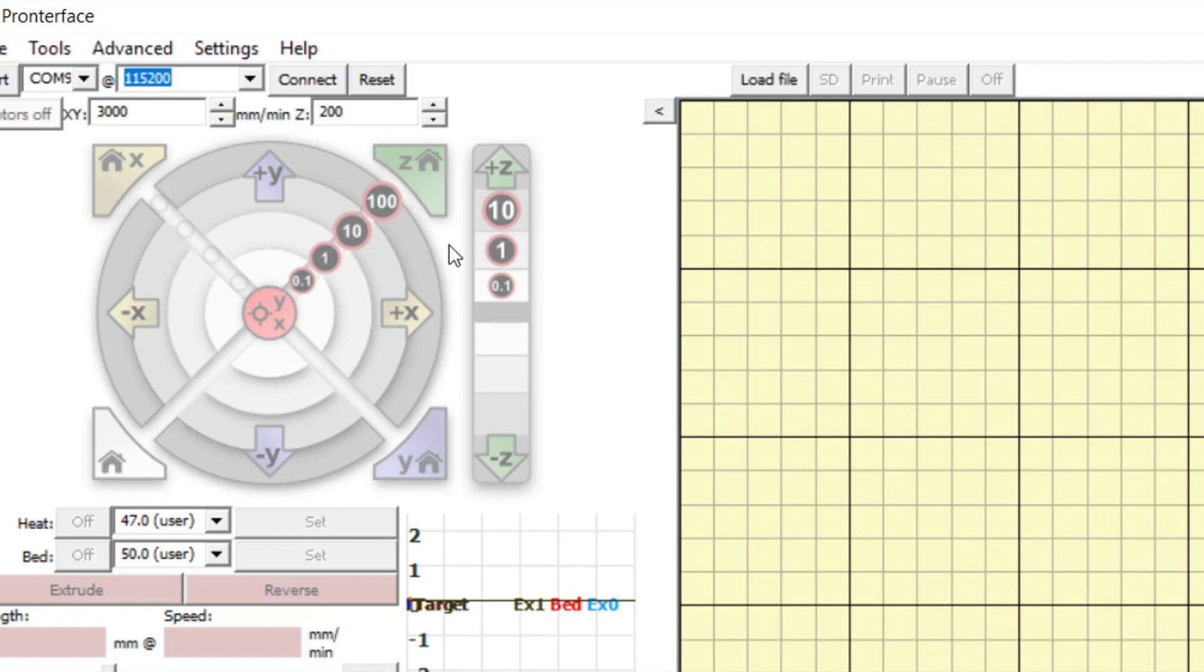You can also move the bioprinter bed in the positive Y or negative Y direction. Note that the movement is relative to the extruder head, so positive Y will move the bed towards you and negative Y will move the bed away from you.